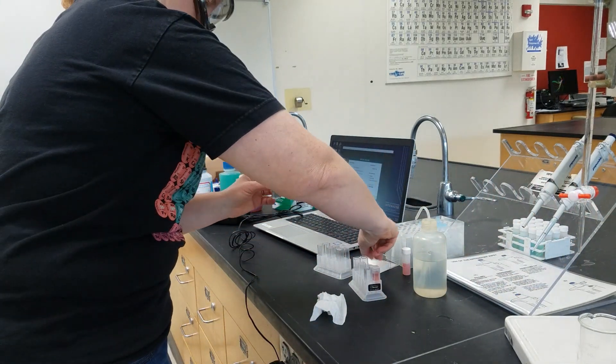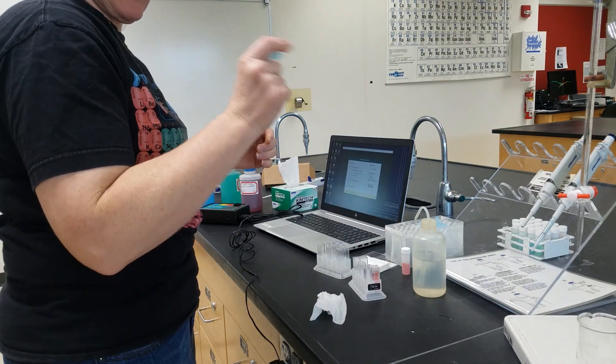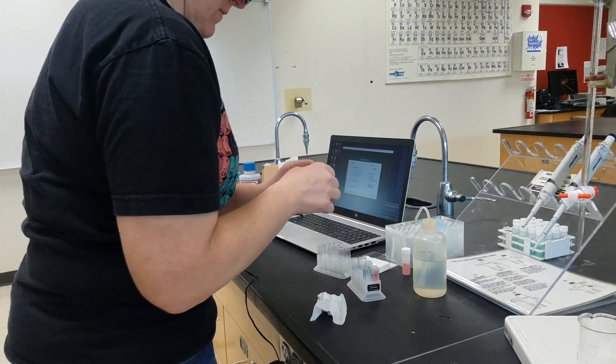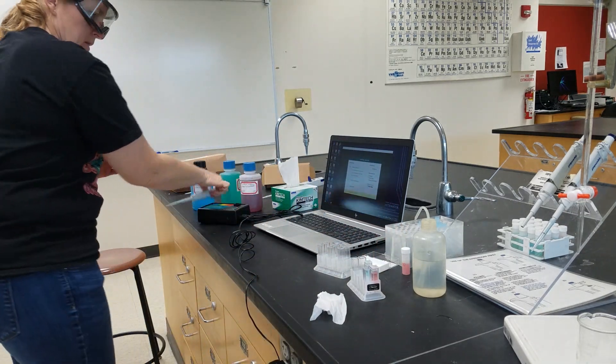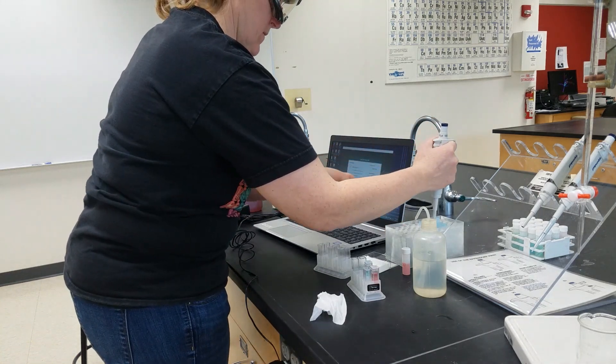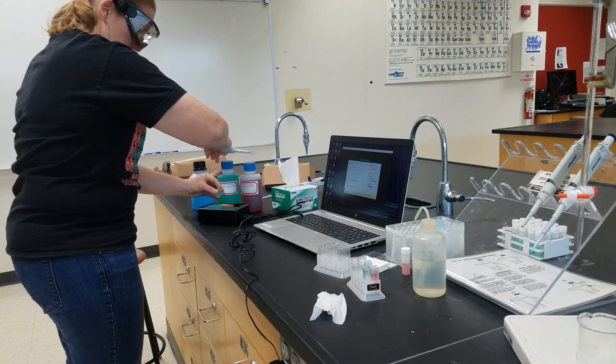And again we are going to want to mix this thoroughly. Then we do the same thing with the nickel.